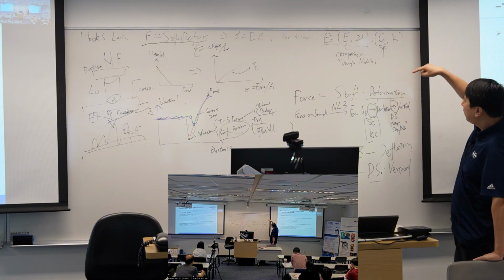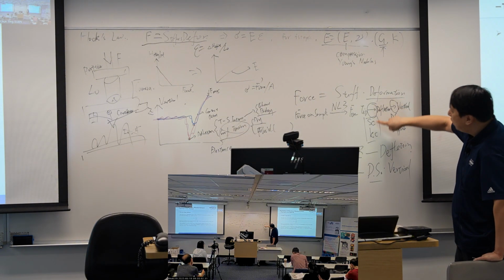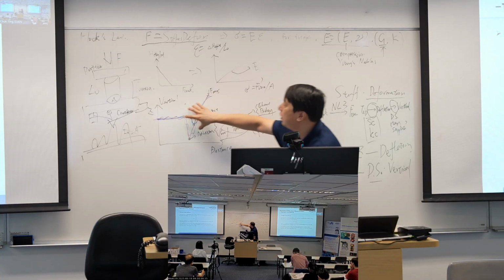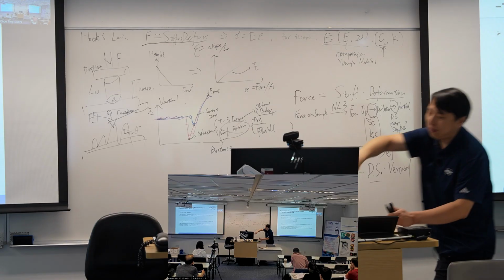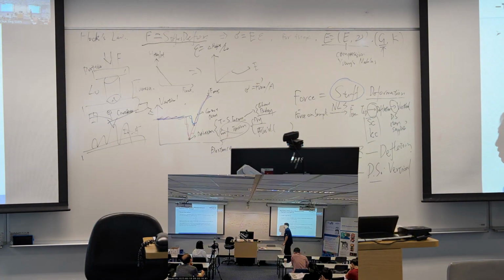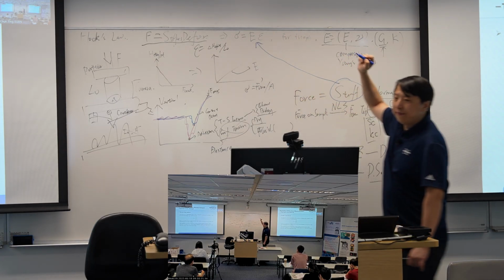So basically, we calibrate the deflection sensitivity, we calibrate the spring constant, and we can transfer this force curve into the force against deformation curve. And finally, we get our stiffness. And this is our phase 1 job. The next job is we try to seek the Holy Grail.